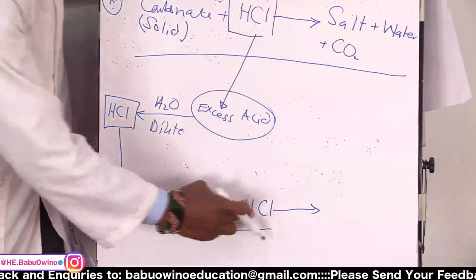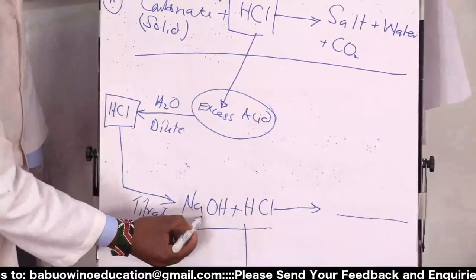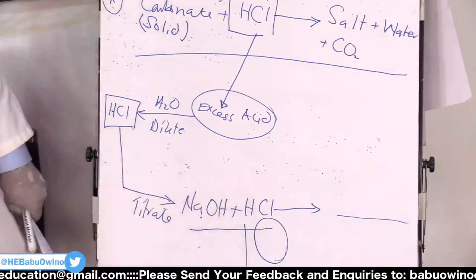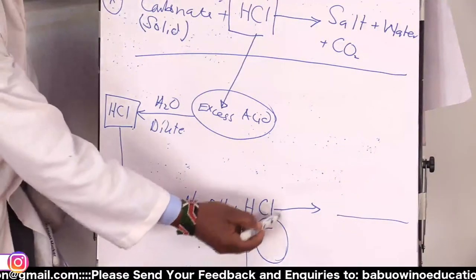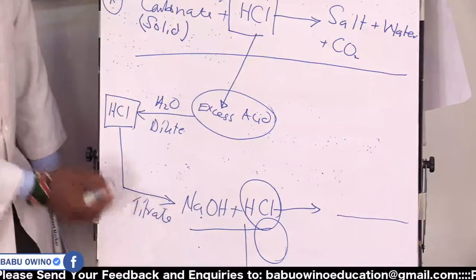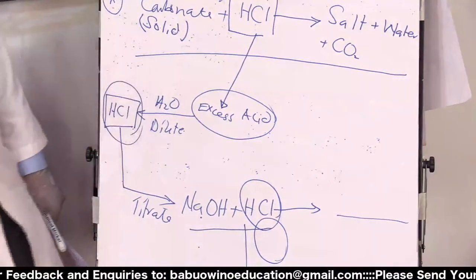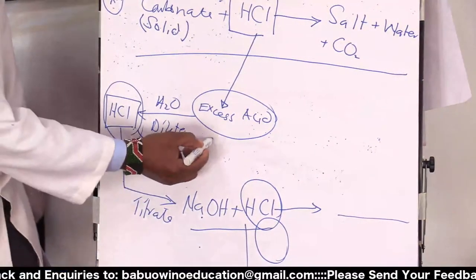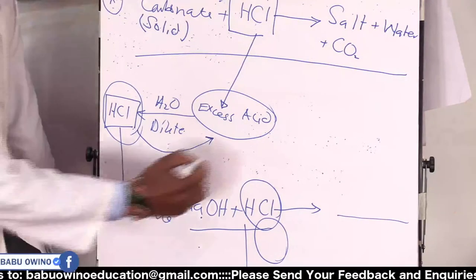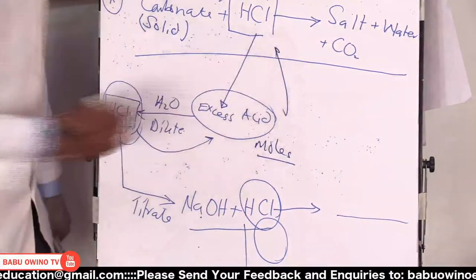But once you work out this titration, you know the molarity of this and the volume from the pipette, then this becomes the burette reading. You can get the concentration of HCl. This concentration was of the dilute one. So you can get the concentration of the acid that was not dilute, and you'll get the moles. Those are the moles that were in excess.